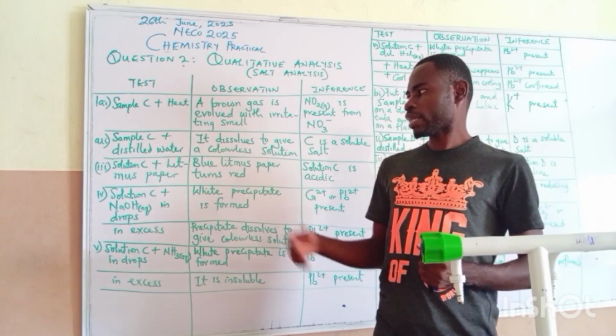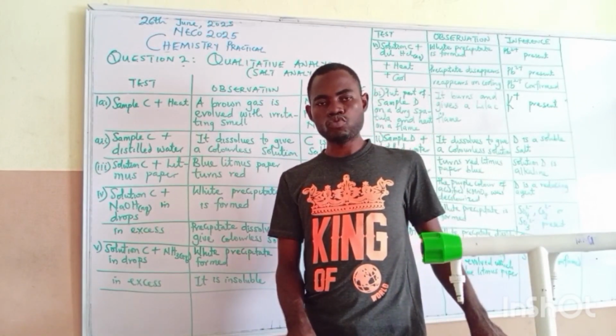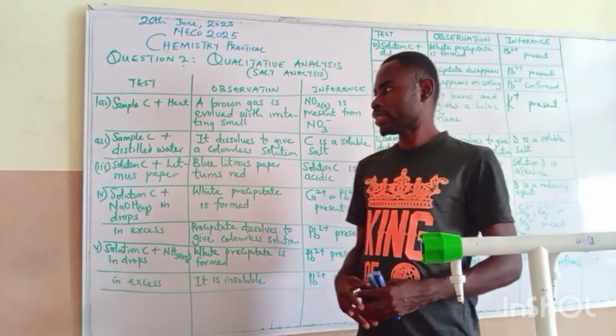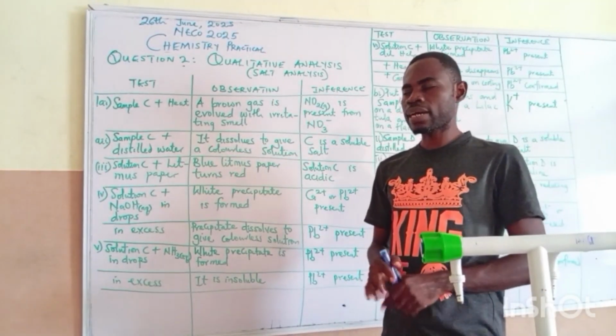But this time around we are bringing out a comprehensive report of when we carried out the experiment in our preparation room, for this salt analysis that you also call qualitative analysis.